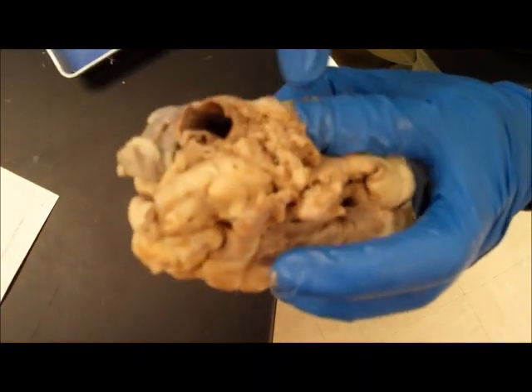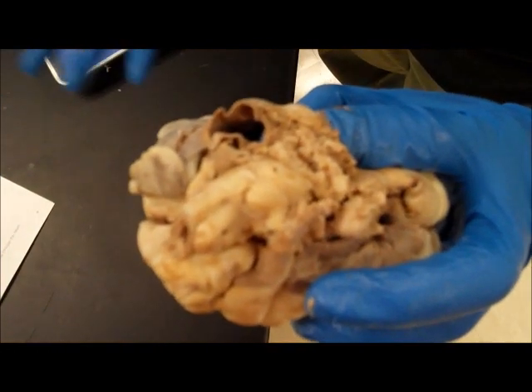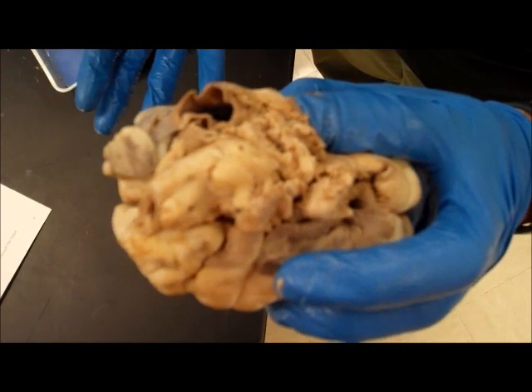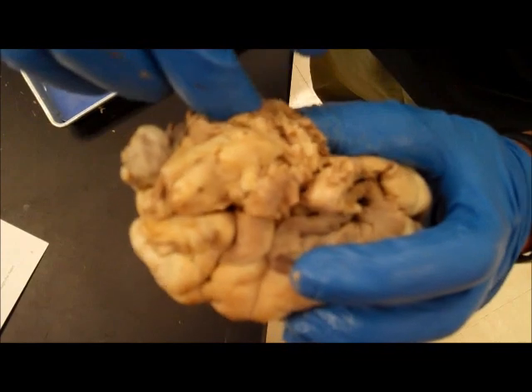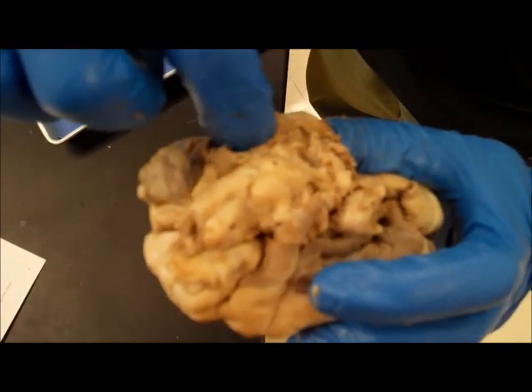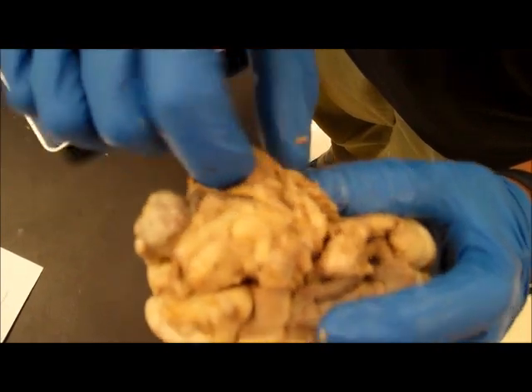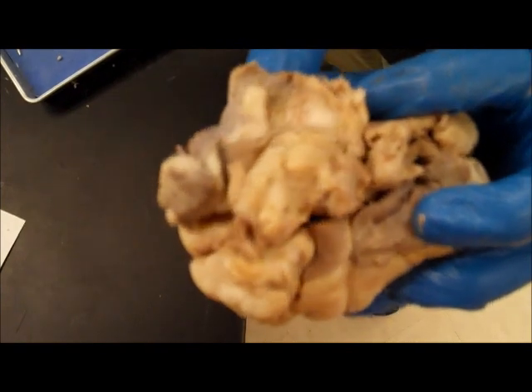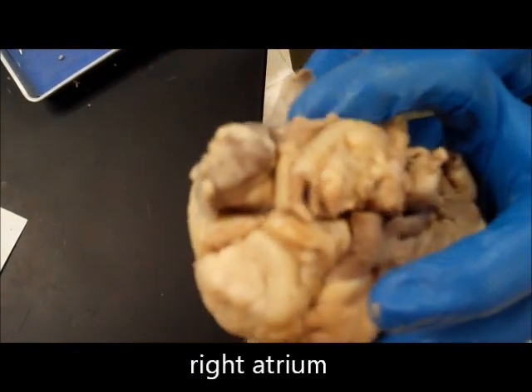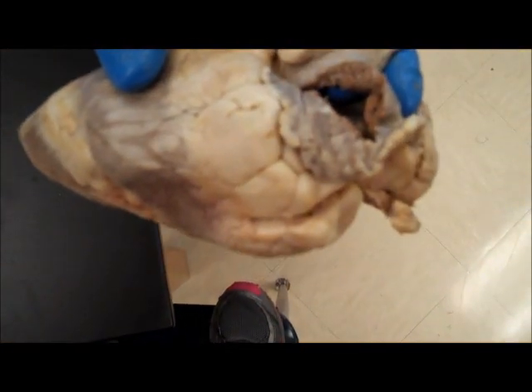The inferior vena cava collects blood from the lower extremities. The superior vena cava is going to collect blood from the head. This blood is going to flow into these veins, and from there go into the right atrium, which you're seeing here. I'm putting my finger there, and we've also made a cut into that so that you can see inside that chamber.